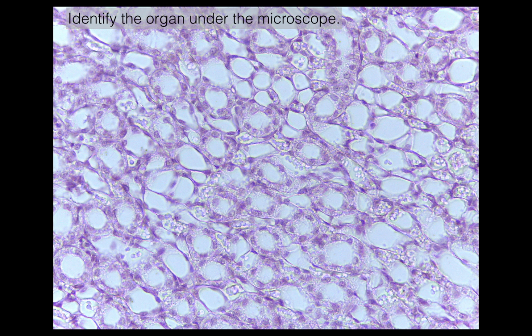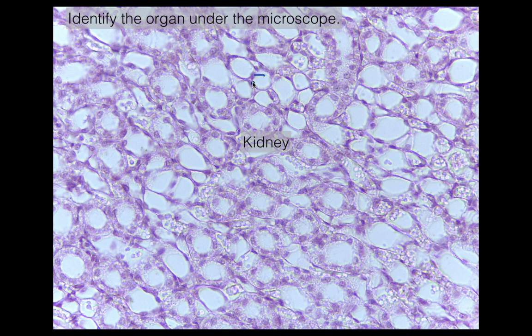You should have come up with the answer: kidney. That's the organ. The region of the kidney would be the medulla, and the reason you know that is first of all because you do not see any renal corpuscles. But specifically what you do see here are the tiny little loops of Henle, and these are going to be tubes that are lined with simple squamous.